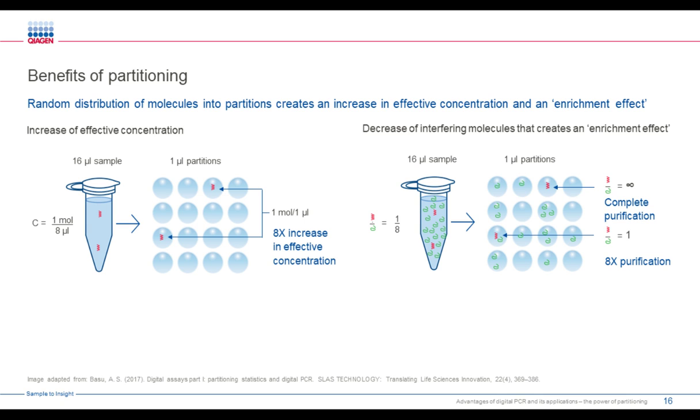If we take this same setup, in this pure setup, these two molecules will probably be found by real-time PCR and will come up at, let's say, a Cq of 38 or 37, because they have no competition. It's very pure, so they will likely be found.